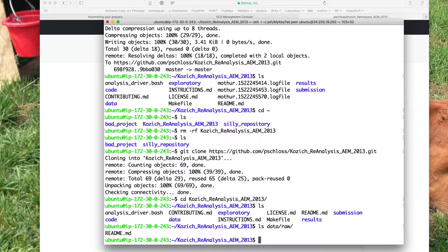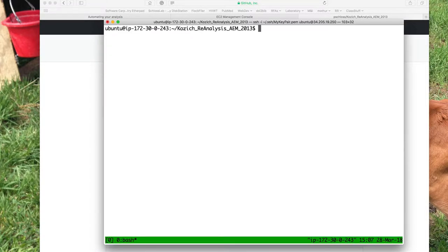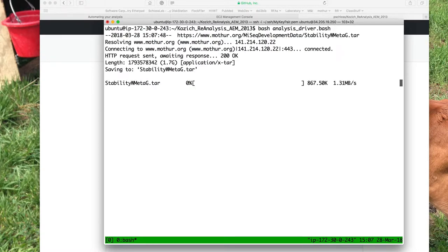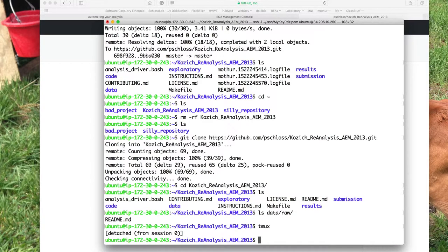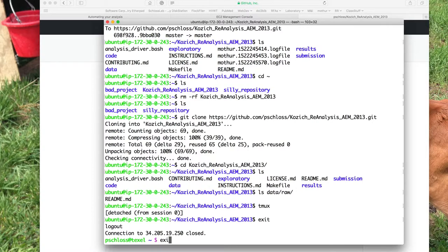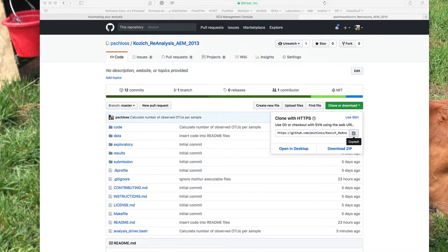I'm going to run this in tmux. So we can do tmux, then bash analysis_driver.bash and hit enter — away it goes. Remember, we can get out of this by doing Ctrl+B, D, and we're back at the command prompt. I can exit out and come back in an hour or so to see where things are. Note that for now, we do not want to stop this from running.